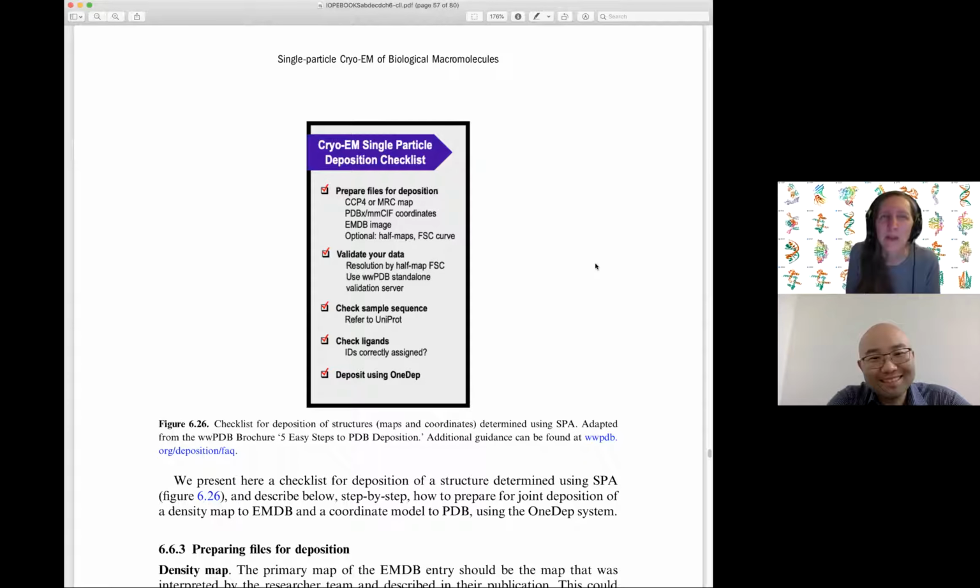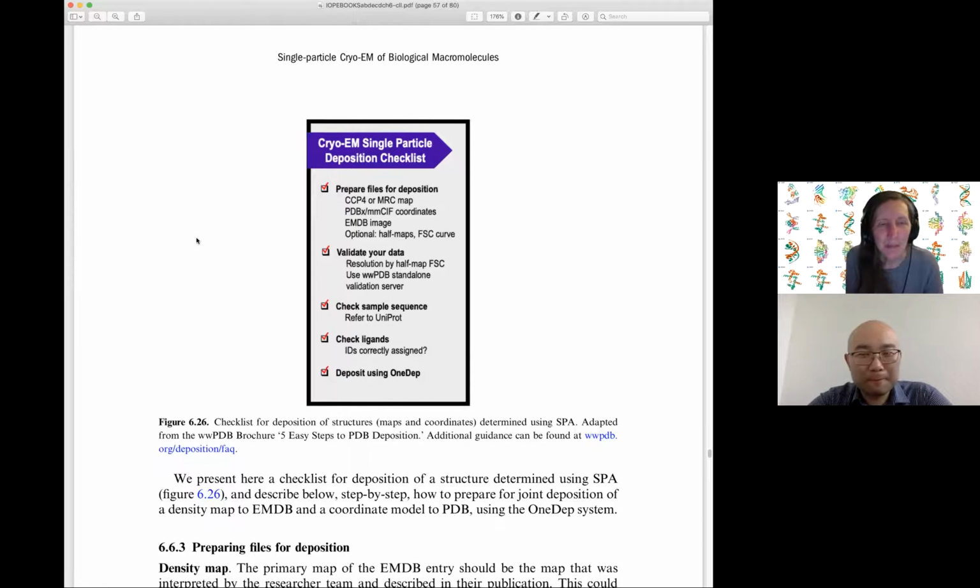Did I rant about that last year? I might have ranted about that last year. It used to be that Ramachandran plots gave you some independent validation of the quality of a protein structure, but nowadays people actually use Ramachandran restraints, and that totally screws it up. So everybody has perfect Ramachandrans.